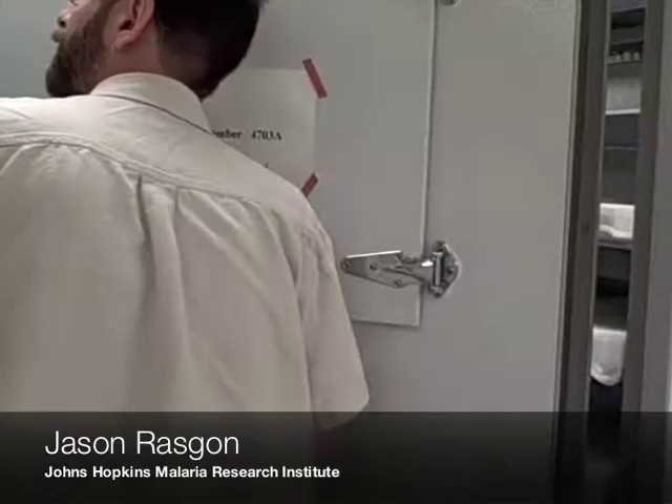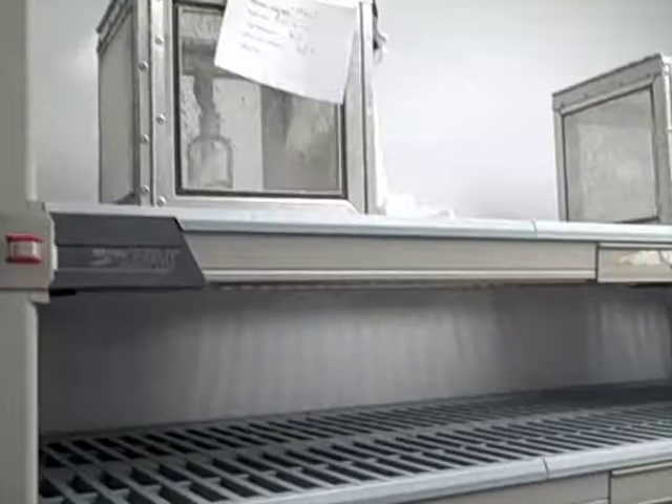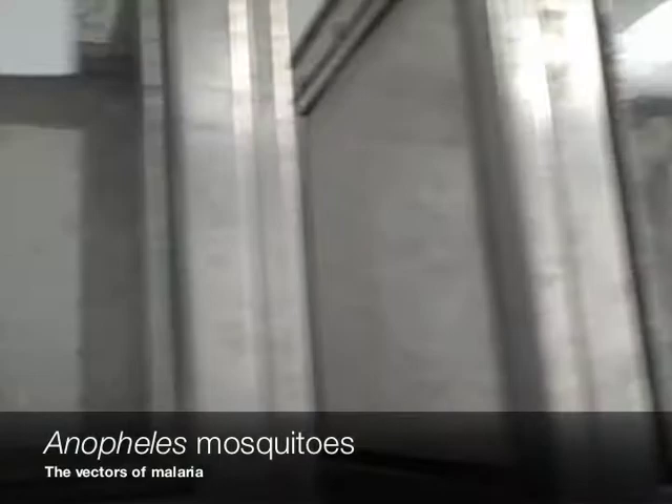This is where we have pans with larvae — or actually these have just emerged, so you can see the adult mosquitoes. And then we have cages of adults. We've got a number of walking chambers like this. And this is just maintaining stocks at the moment — yeah, this is stocks. So we have a core insectary facility basically.